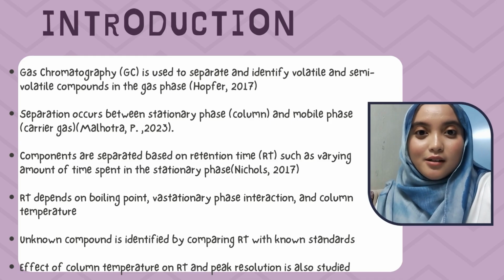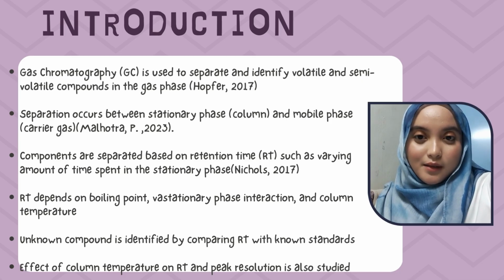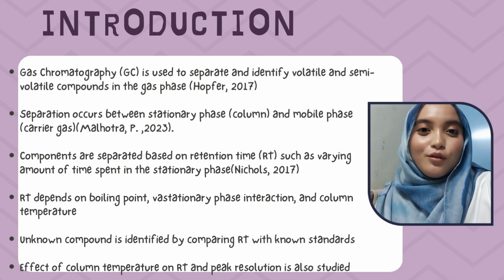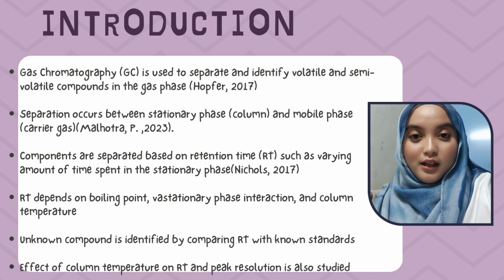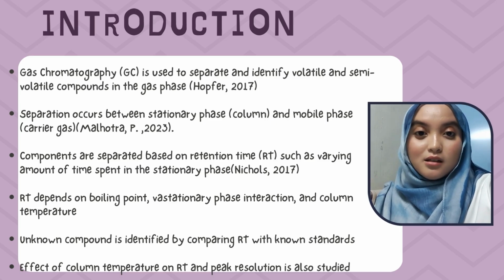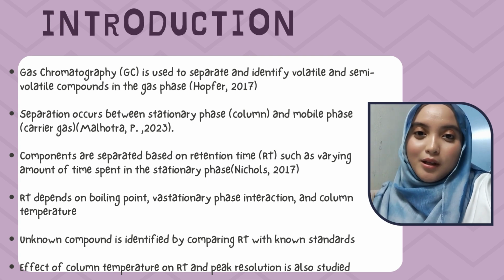Different compounds interact differently with the column, so they come out at different times. In this experiment, we use GC to analyze both a mixture and unknown samples. The separation is based on retention time, or RT, which depends on factors such as boiling point, interaction with the stationary phase, and the column temperature.